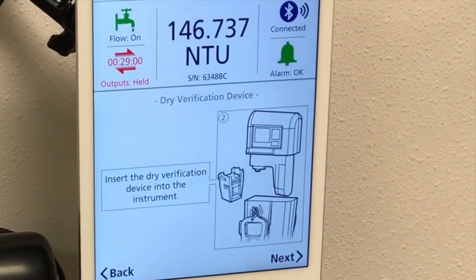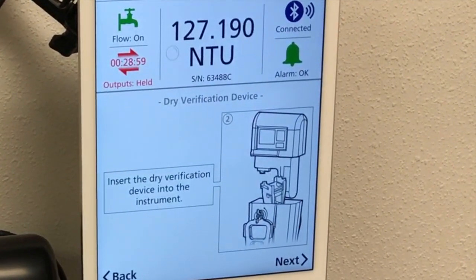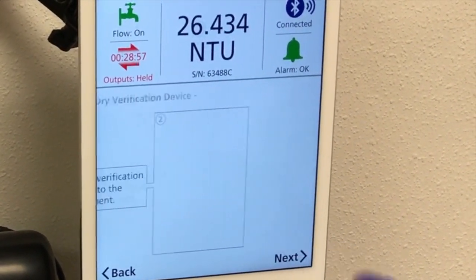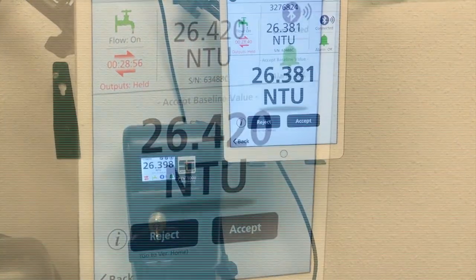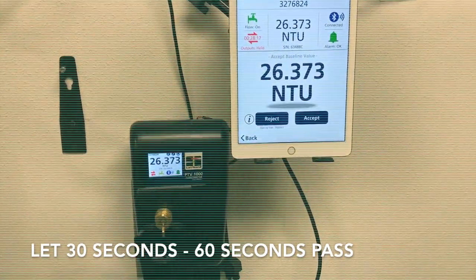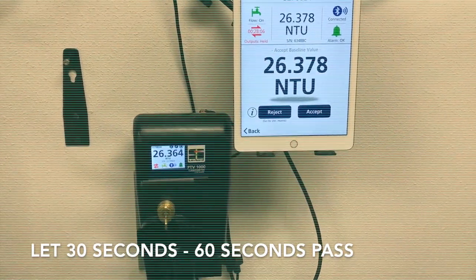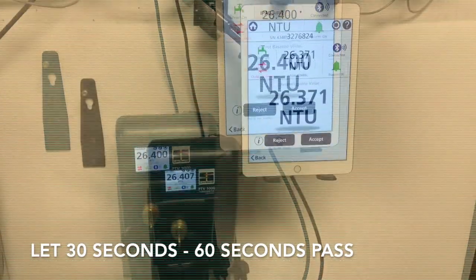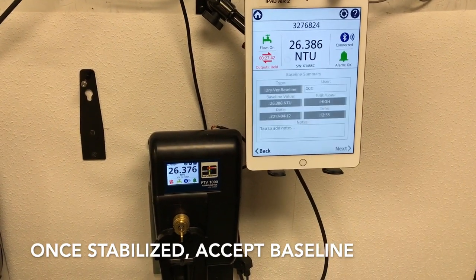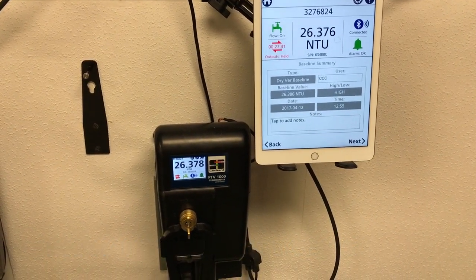Moving along, stabilization of the baseline needs to occur. Once adequately stabilized, you can accept the baseline value.